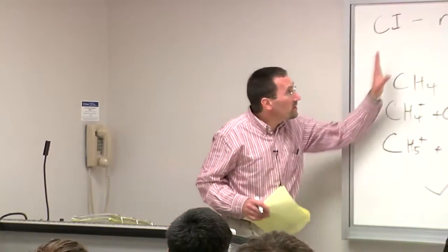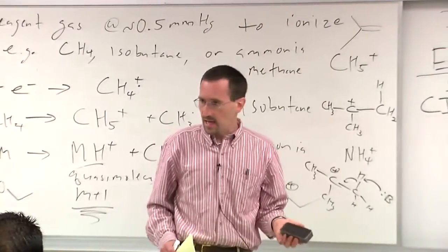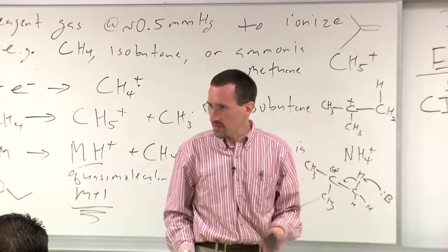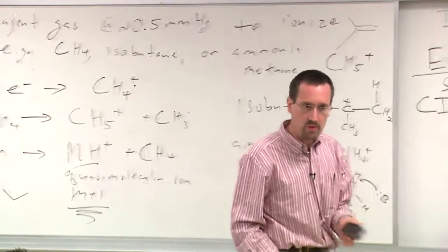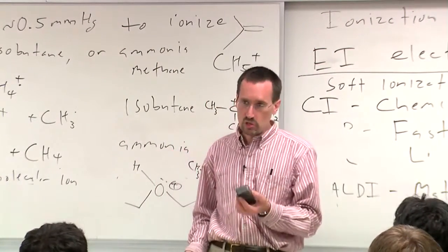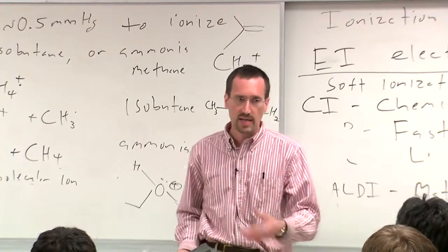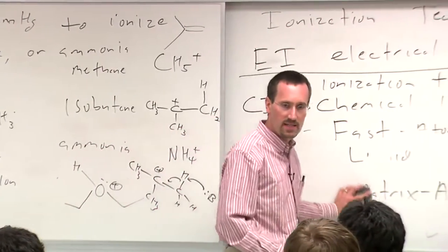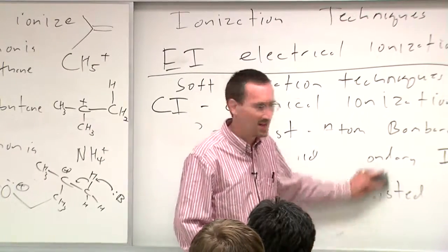Now the problem with CI mass spec is you still have to get your molecule into the gas phase. And so for a very, very big molecule, this may not be feasible by heating it even in a strong vacuum because the molecule may not vaporize, it may just decompose, right? If you go ahead and you heat up sugar a lot, you don't have the sugar boil, you have the sugar carbonize. And similarly for other organic molecules, they may simply carbonize and then you get those roasty, toasty caramel smells, but not the smell of actual sugar.